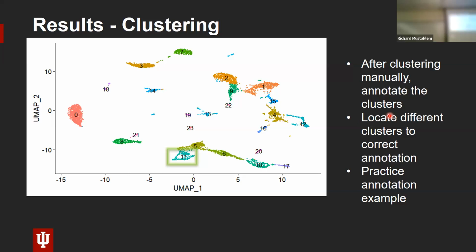So what this is doing is I'm trying to rename the cluster, but it looks like it's not working. So what we could do is just skip that line. You would have to go back and reread in your data, and then scroll down here and skip the idents. I was going to use this as a lesson if you wanted to switch between resolution, but we can just go past that. So go ahead and rerun it, and then skip the idents brain because it's relabeling everything. You don't need to rerun all this, but you can just reread in brain.